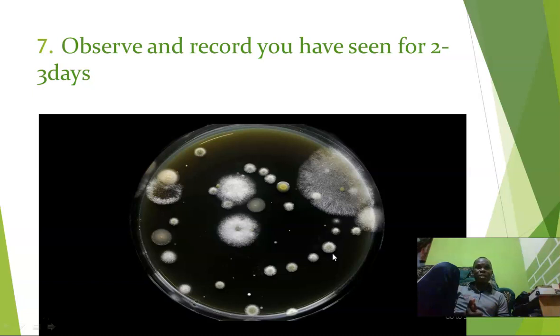I told you the meaning of aseptic environment. One that is coughing or sneezing should not be allowed to be part of this experiment. And you make sure you sterilize every material you are using in this experiment if you want to get a positive result. So this is a kind of steps in how to culture microorganisms.